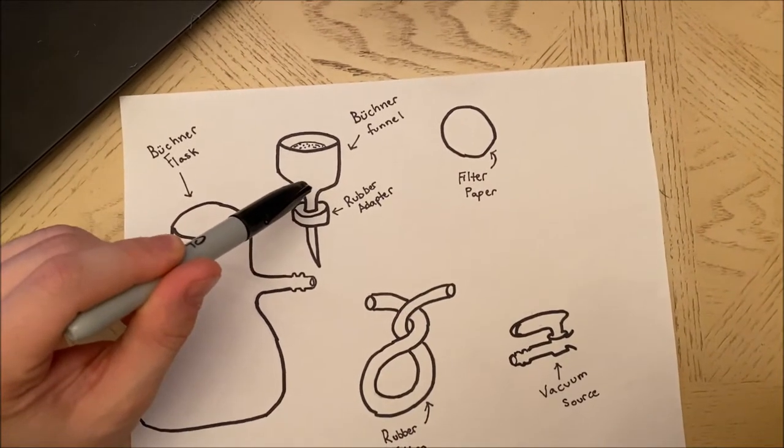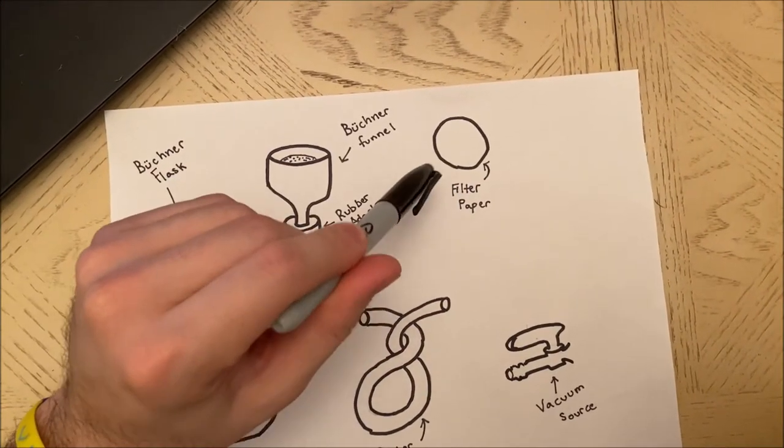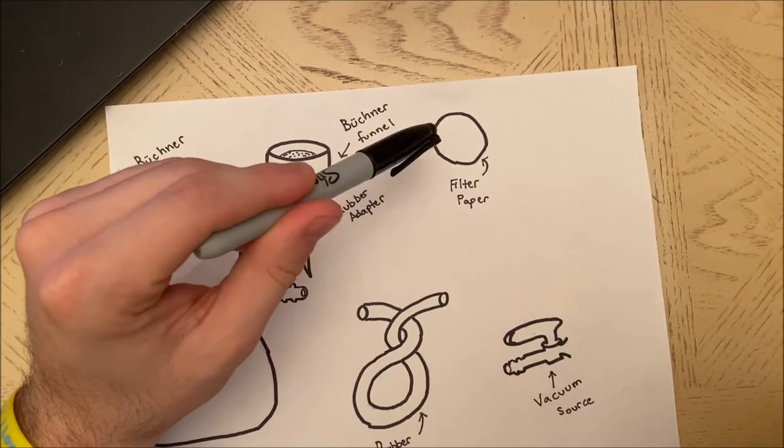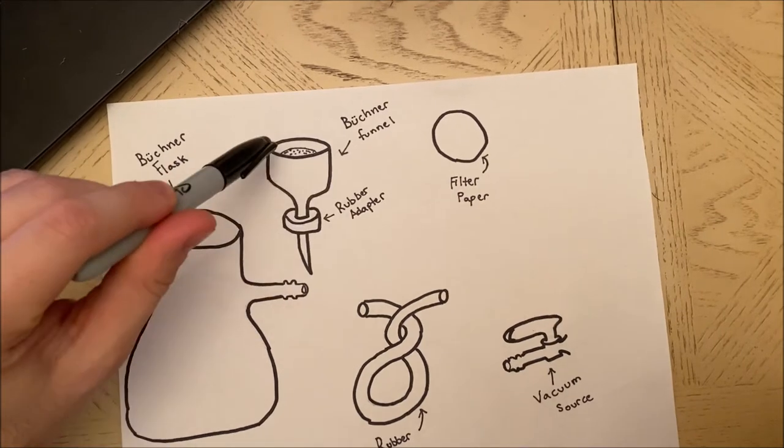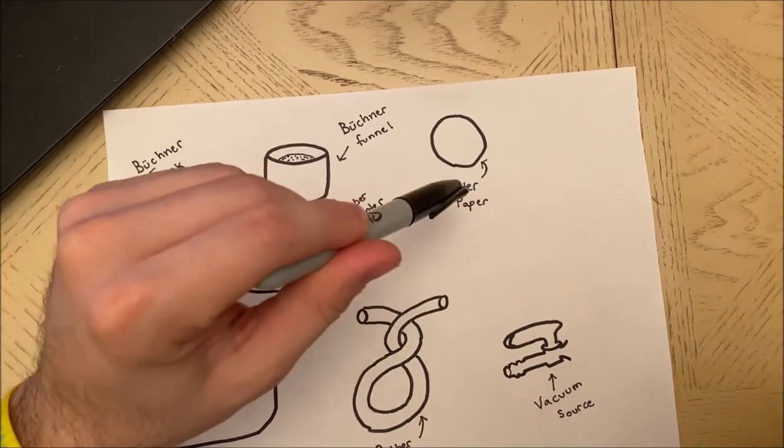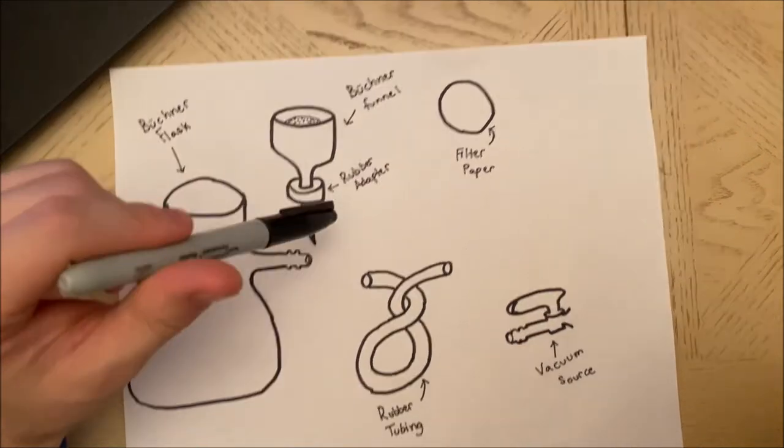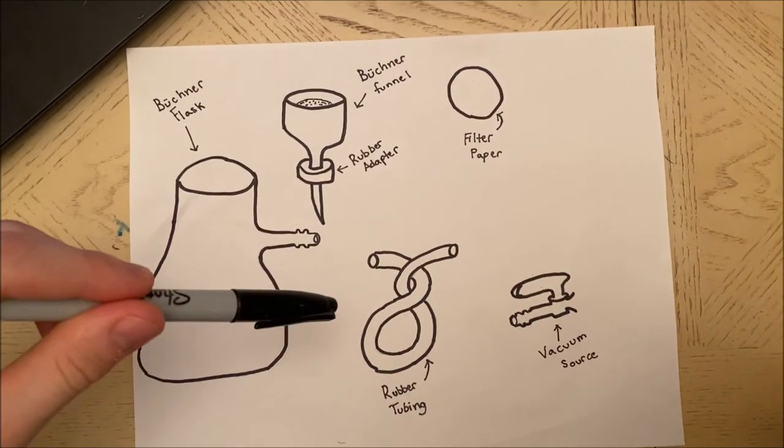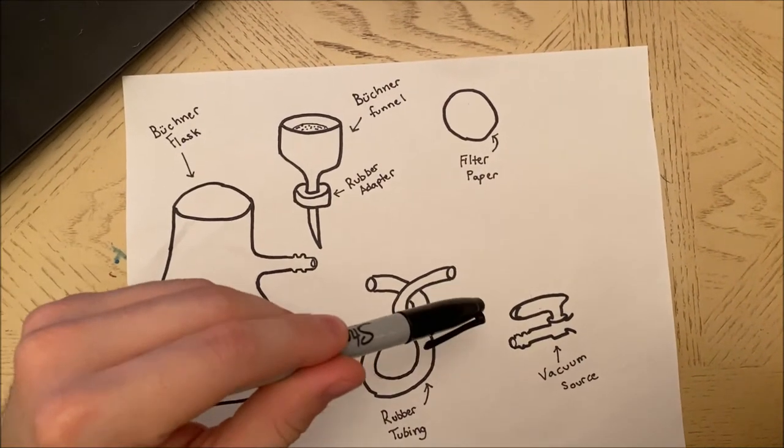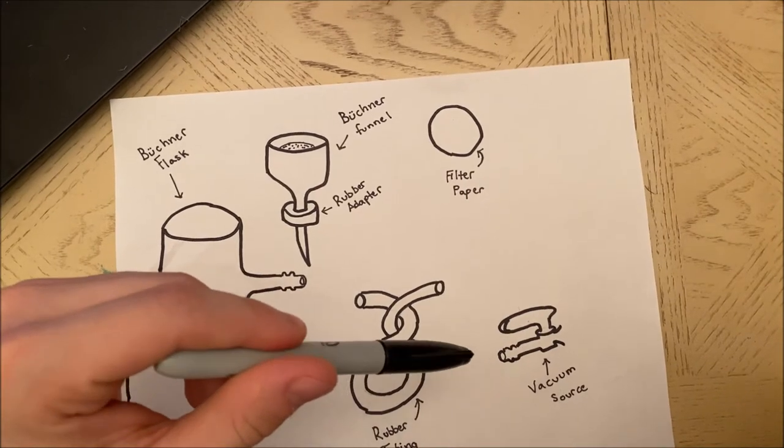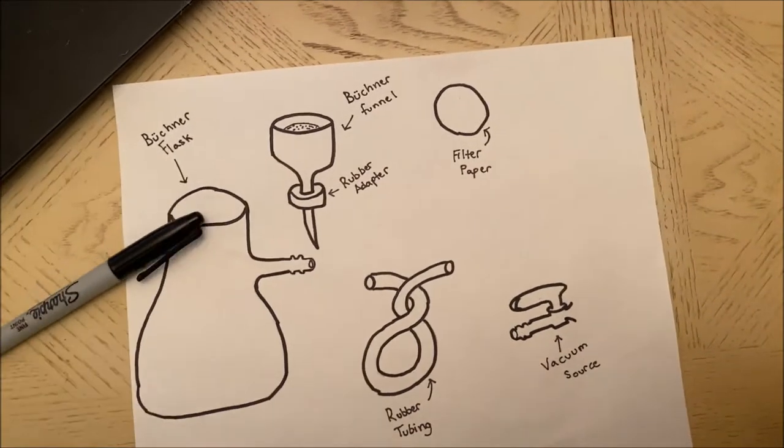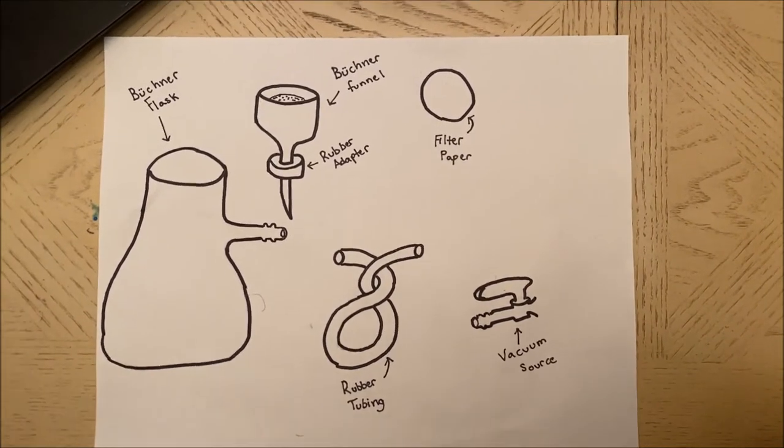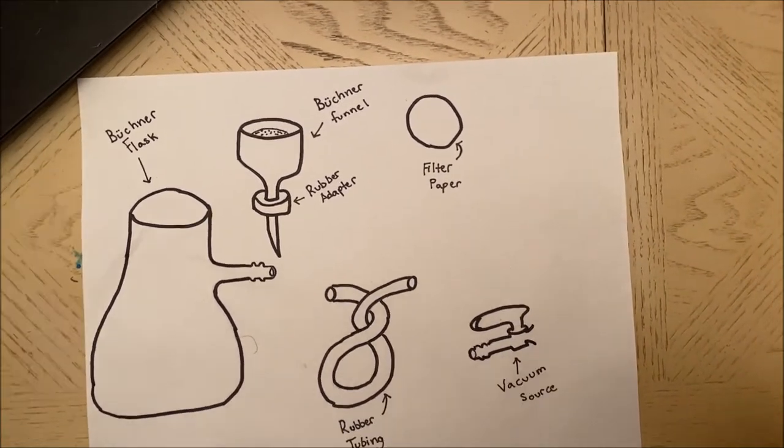We're going to need filter paper. We need to make sure that the filter paper is large enough to cover all the holes in the Buchner funnel but small enough to fit inside. We're going to need rubber tubing and then a vacuum source, usually this is something in the lab like in the wall that we can use.